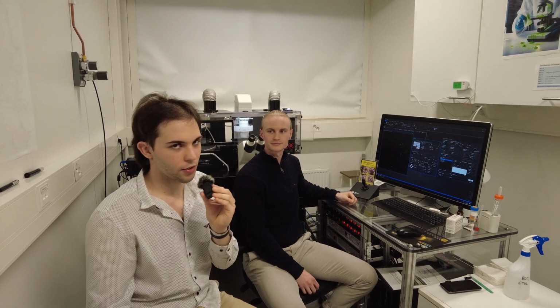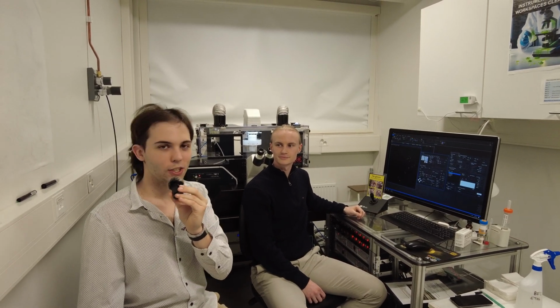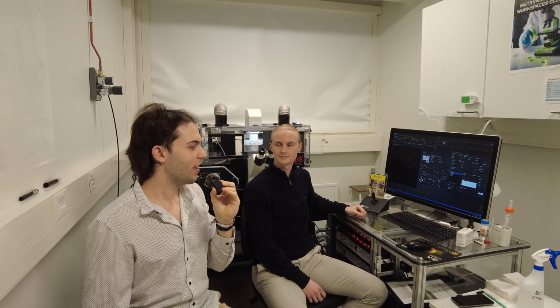Wow, that's truly interesting. It's worth mentioning that Turku is one of the leading institutions in bioimaging. And that's very cool, because with these types of microscopes that analyze fluorescence, you can not only see the visible light, but you can also create custom labels for some specific data, and you can read this data through fluorescence imaging, and that's literally what we are seeing.